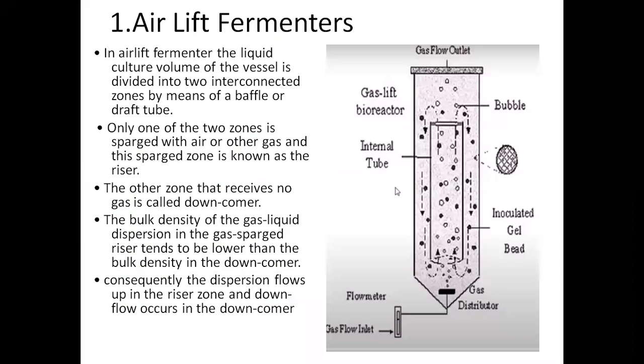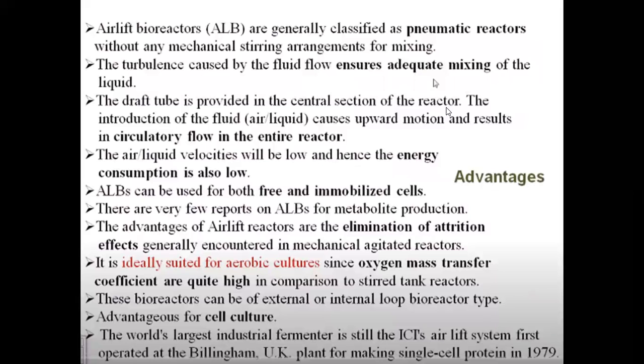So basically there is a circulatory flow inside the reactor. From here it is rising up, again it will go down the downcomer, and again it will rise up in the riser. So there is a circulatory flow inside the reactor vessel. The air and liquid velocities will be low and hence the energy consumption is also low.